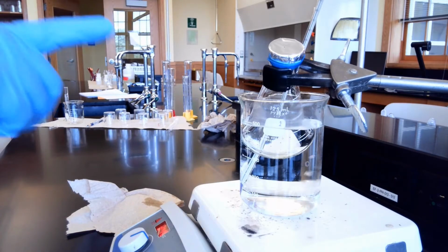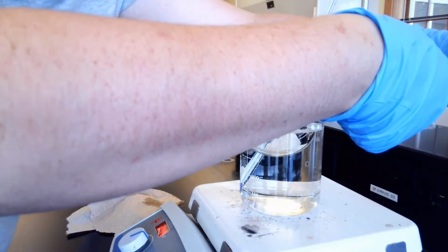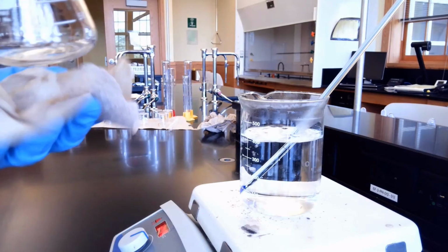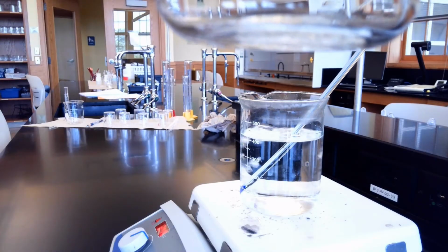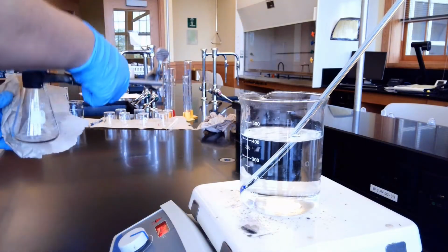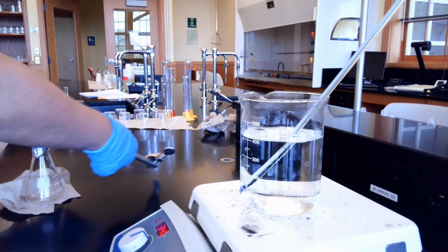So all of the vapor has escaped for the most part. We're going to lift this up, unlock it, lift it. I'll move it to the side. I'm going to wipe the bottom off so you can see there's no liquid in the bottom. We're going to set this to cool, okay? Right down here. And then we'll get its mass shortly.